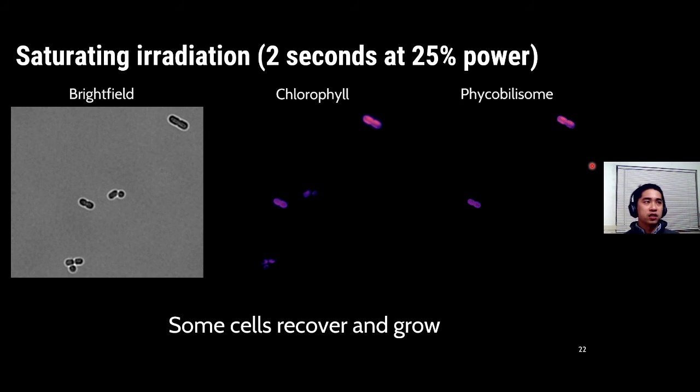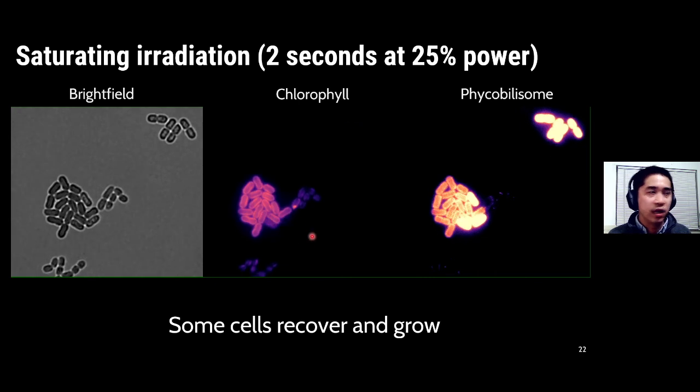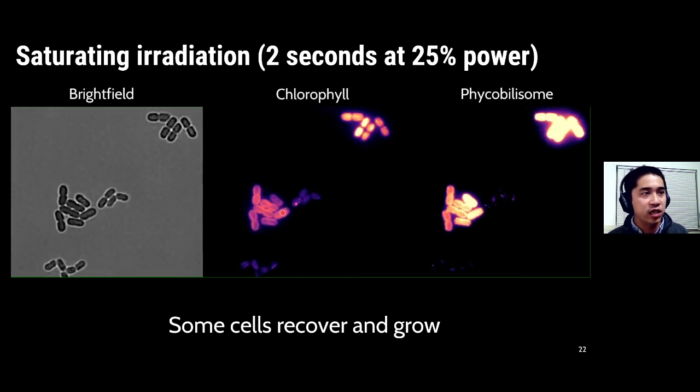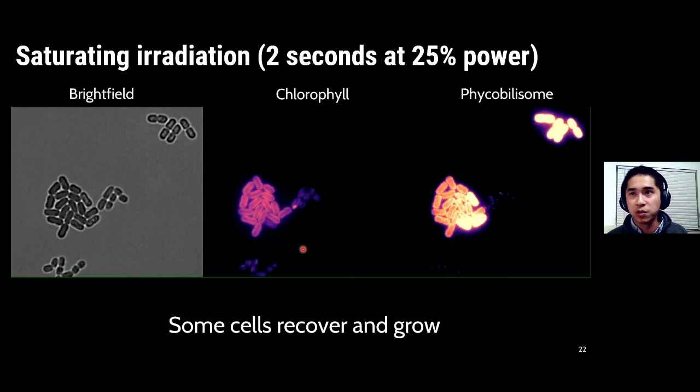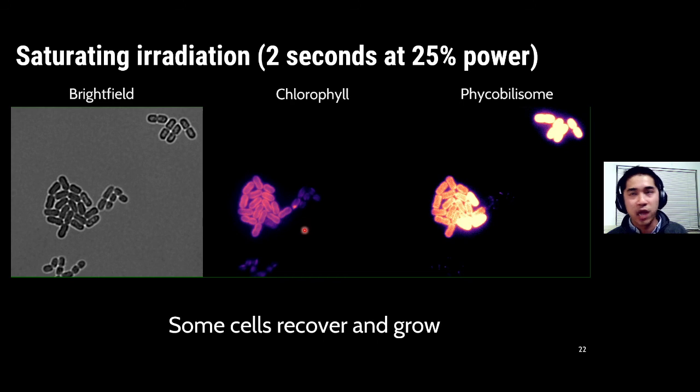Okay, so let me show you now the condition with the saturating irradiation. And again, these ones here are the wild-type cells, and these ones here are the delta CPC cells. Okay, let me play this video again because I think that there are some interesting phenotypes to point out. So first of all, I'd like to draw your attention to this wild-type colony here. So you'll see as I play the movie, the cells get blasted with light, and you can see that these three sister cells here stop growing, but this sister seems to continue to proliferate, which is interesting. Next, if you look at this cell here, which is a delta CPC cell, you'll see that after the cells are exposed to light, little bright puncta forms, and then seems to migrate to one edge of the cell. And what I think is happening there is that basically, that spot is some sort of repair mechanism or recycling mechanism. And yeah, that's basically what that is indicating.